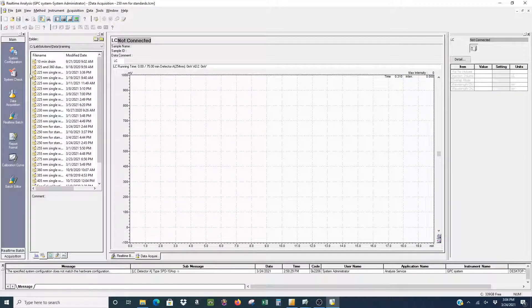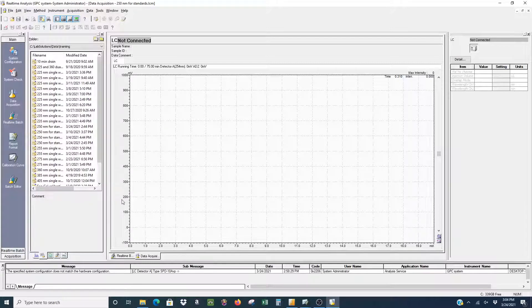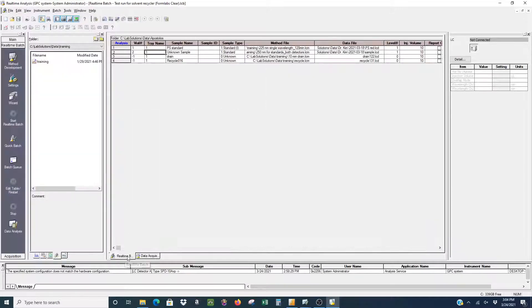The next step would be to just go back to the main and then go to the real-time batch, which can also be seen on the bottom there on the other tab.